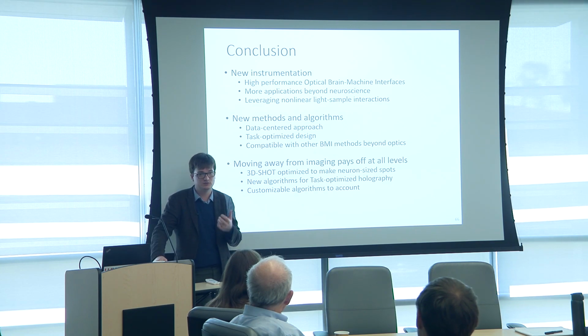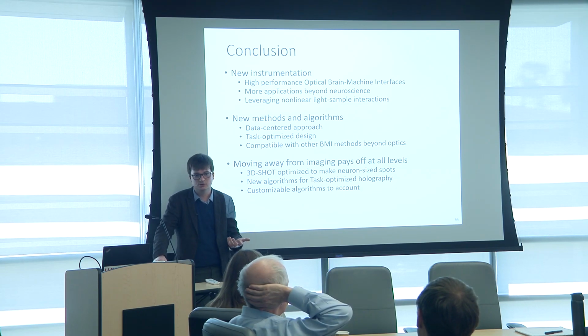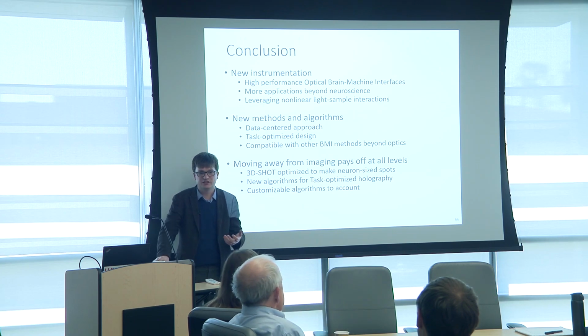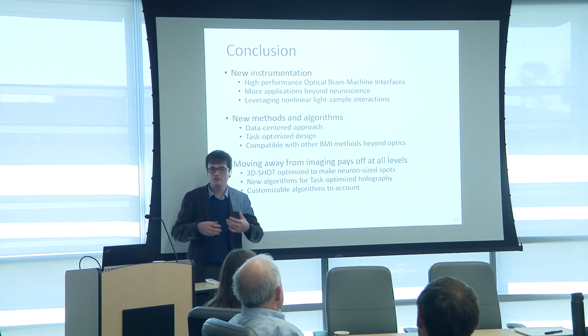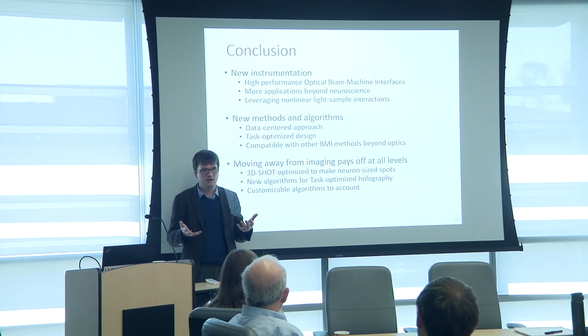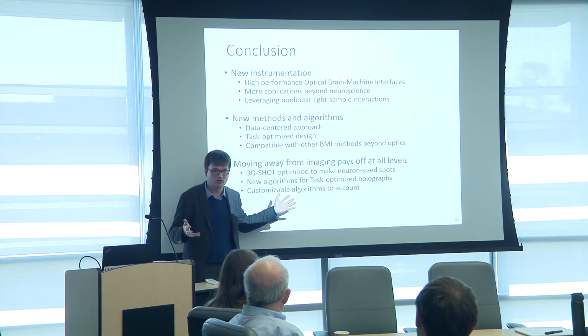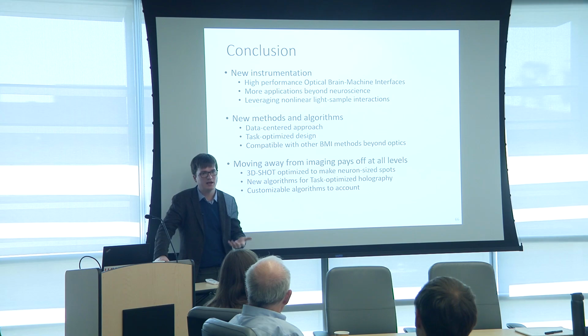The other element that is relevant to us is that when you modulate phase, you keep your photons. Modulating intensity is typically done by controlled absorption, and you don't necessarily reshape your amplitude, but rather lose your amplitude in the process. So although we would get better holograms if we had the ability to modulate phase and amplitude, therefore covering every possible hologram according to the Huygens-Fresnel principle, the holograms that we cover with phase are already covering most of that space and also preserve the photon count, so they give us more ability to create custom illumination patterns.